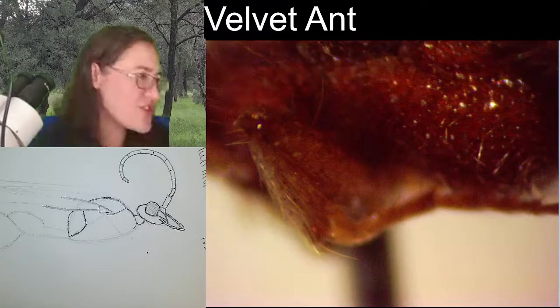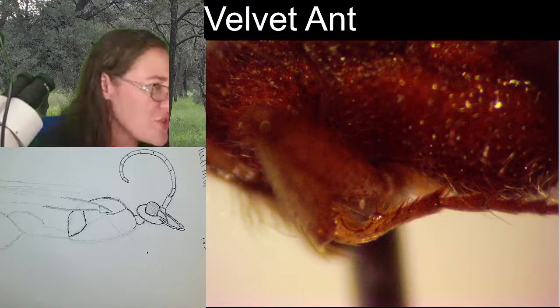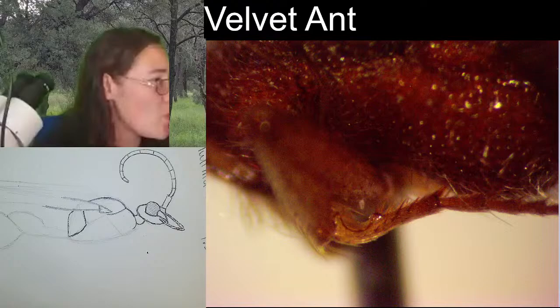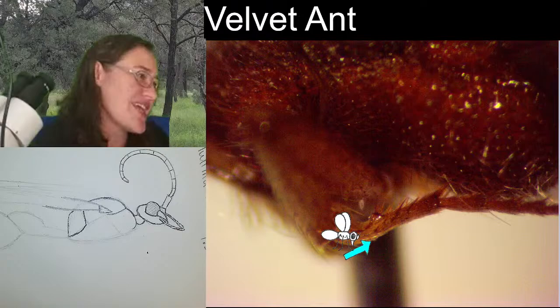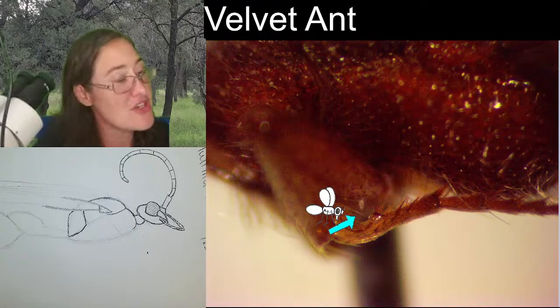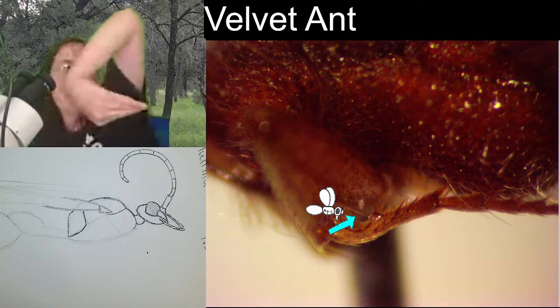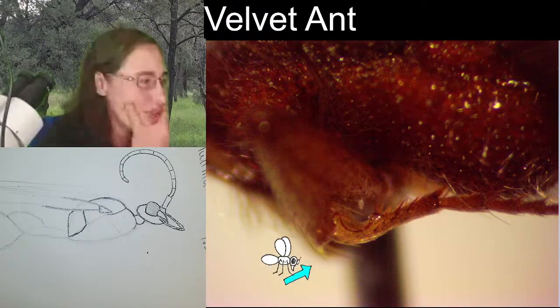So the first tarsal segment is right here of the first leg, and we could all speculate together what the purpose of this is, but there's a darker kind of sclerotized U on the bottom. This would be on the bottom of the tarsal segment. It looks like it's on the top, right? But that's just because the tarsi are like this. So if we were to draw it like it was walking, that U would actually be on the bottom of the foot.